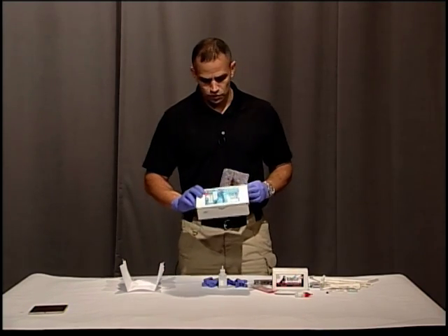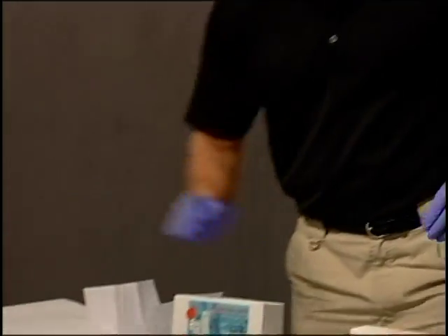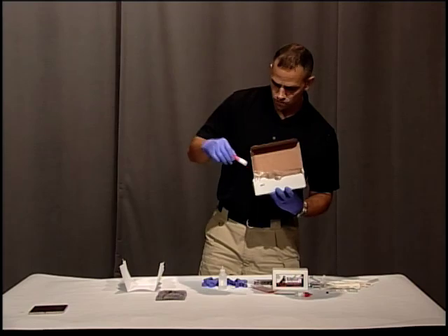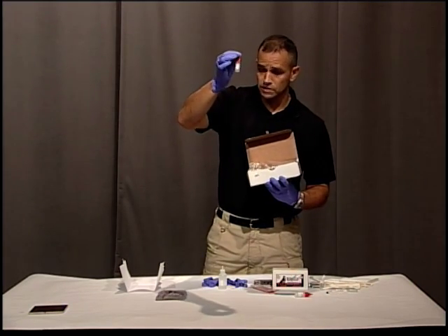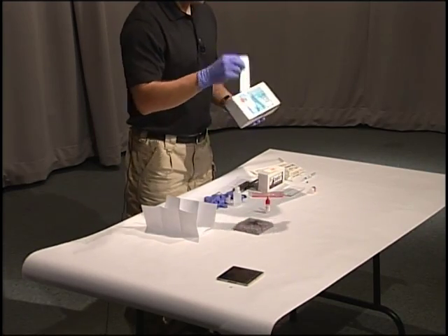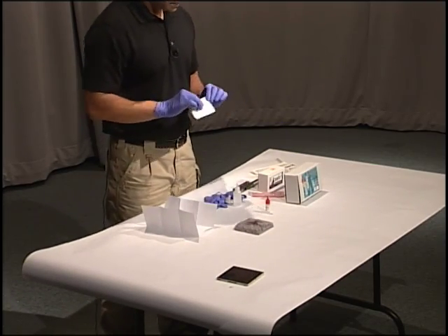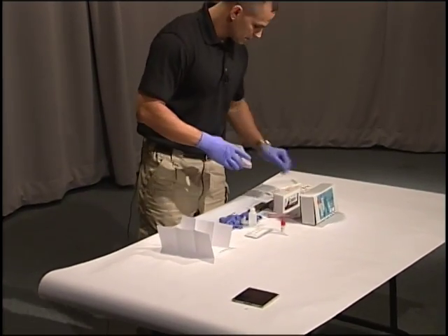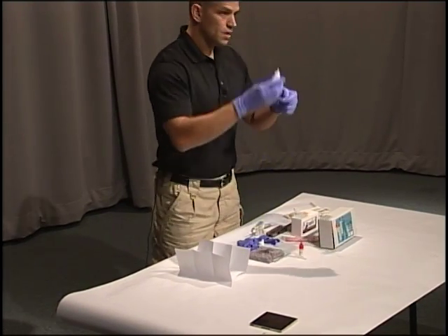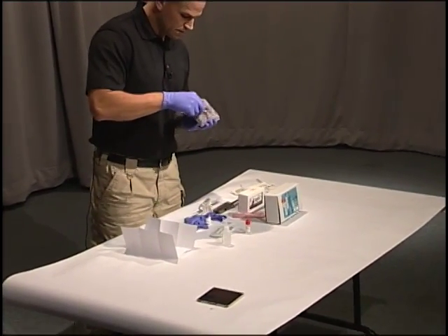What we're going to do to test for human blood is use the Hexagon OBTI tests. Inside the test kit, you have a small ampule with liquid inside, and a packet with the actual applicator. Now we have to collect our sample. I'm going to use a cotton swab, wet it again with distilled water, and swab my stain.